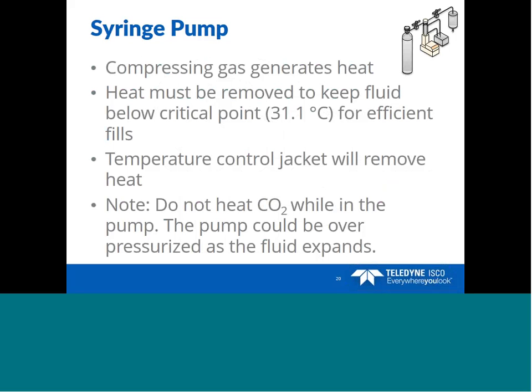When compressing a gas, such as CO2, heat is generated, and that heat must be removed to keep the fluid below the critical point of 31.1 degrees C in order to achieve efficient fills. An optional temperature control jacket can be added to the pump to remove the heat. Also, as a safety note, do not heat the CO2 while it's in the pump. The pump could become overpressurized as the fluid expands.